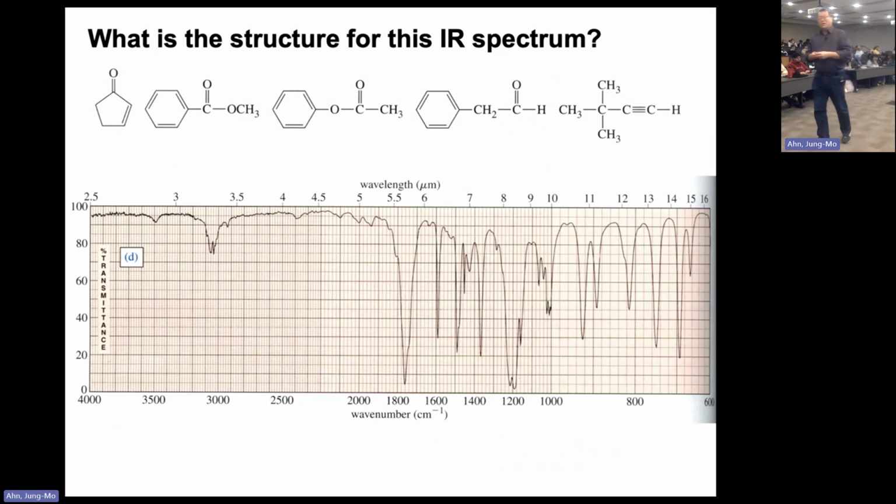All right, the next one is pretty simple, because you got nothing except the carbonyl showing up. That number is really high, like 1760, I believe. This is a pretty high number for the carbonyl stretching signal. That belongs to the ester. So these ones are definitely esters. Regular esters like this.